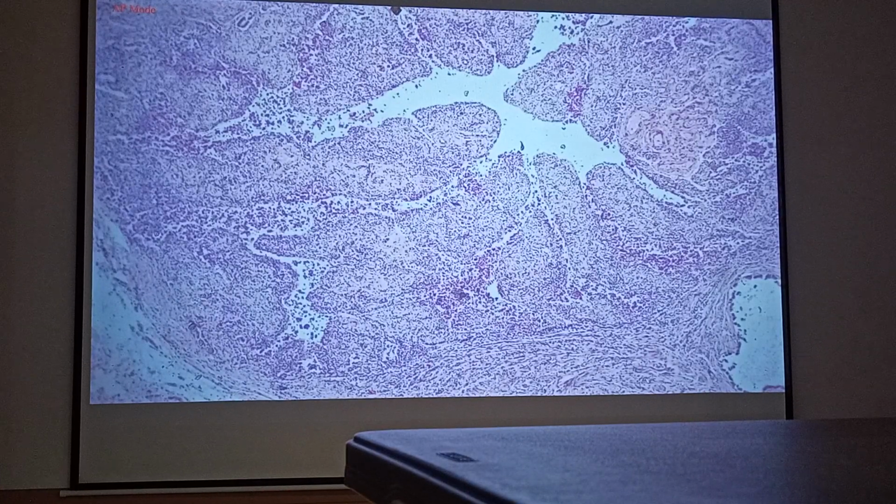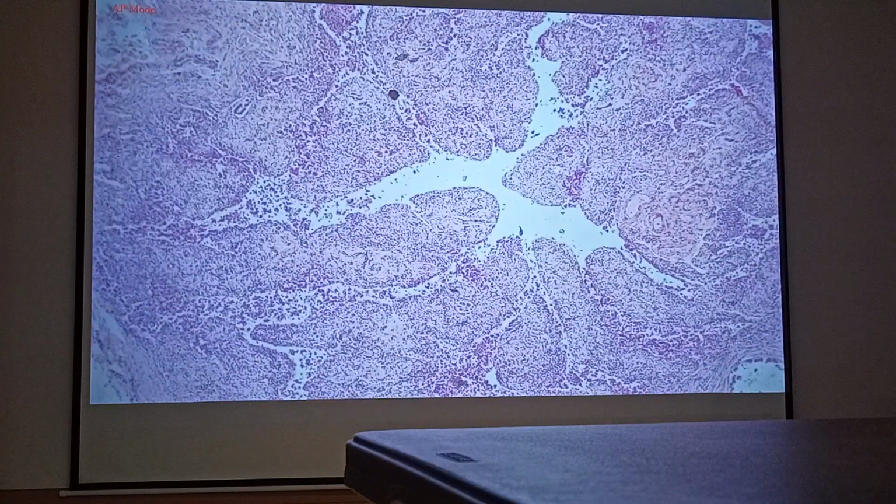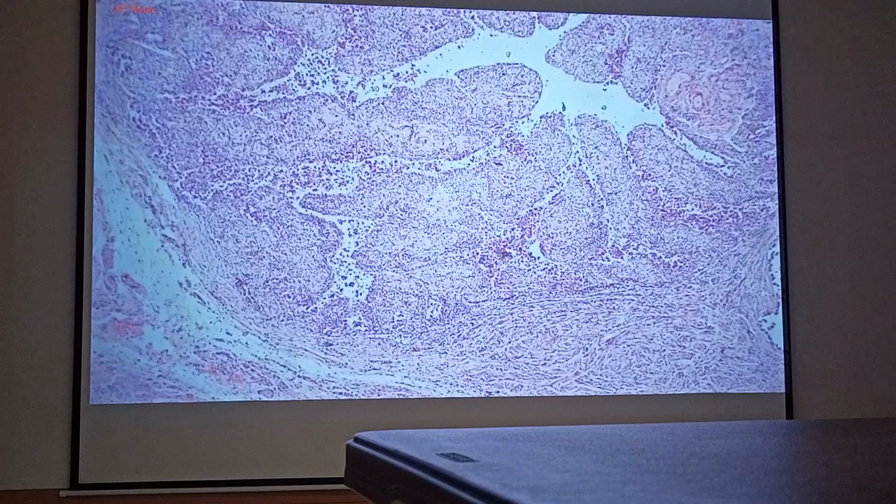By the way, before we proceed with identification of the remnant of the normal simple ciliated columnar epithelium, how do you call this loose connective tissue immediately underneath the epithelium? Lamina propria. You have seen lamina propria already in your first year. It is composed of loose connective tissue. That is why the lamina propria should appear clean. But look at the lamina propria of this mucosa. There are many dots present.